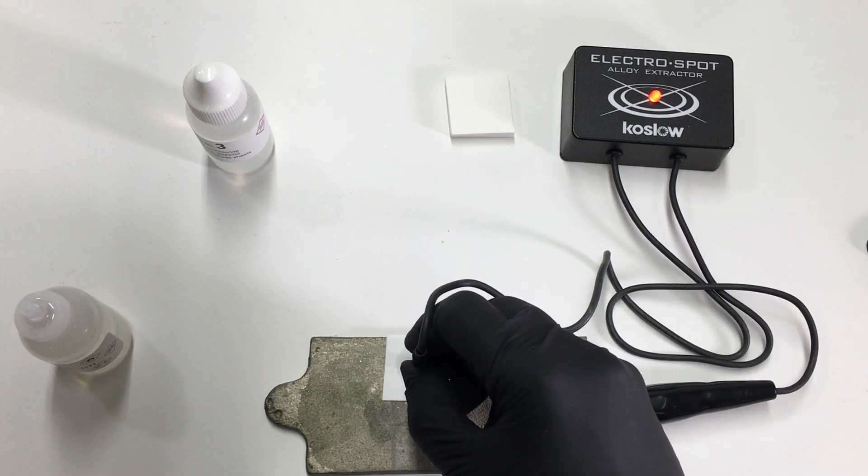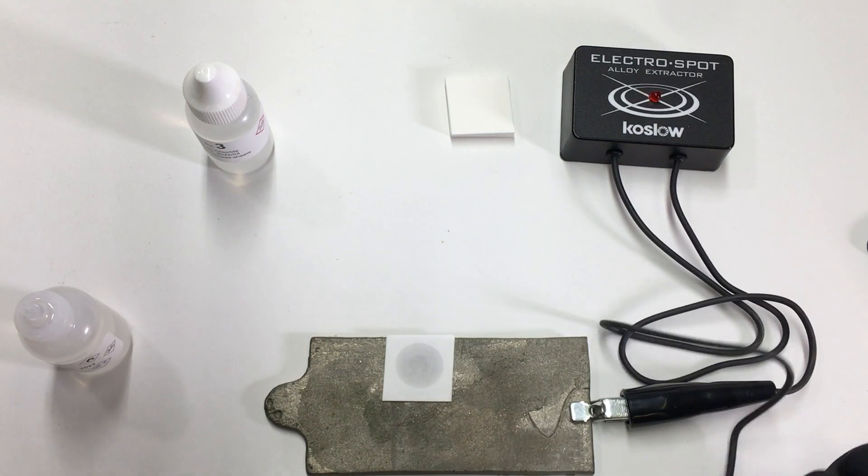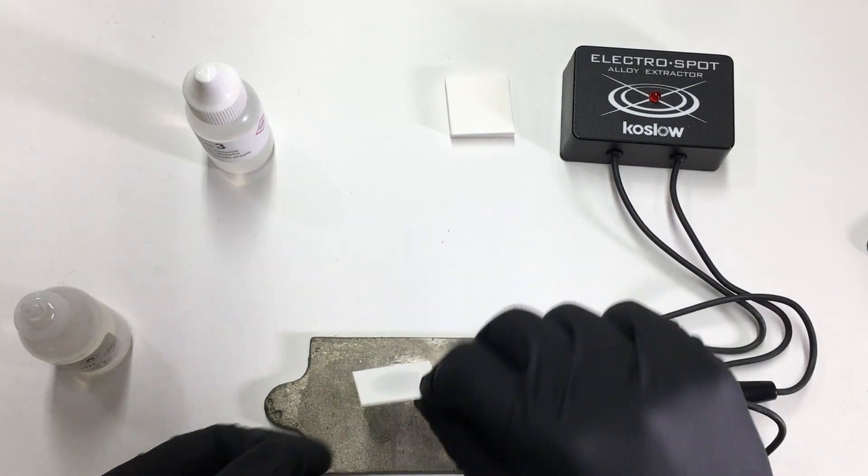Okay, one, two. Only two seconds for the electrospot process.